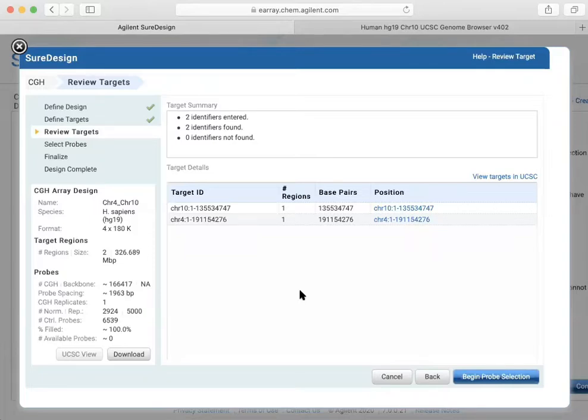I would say at 500 bases it's the easiest, and it just gets a little bit harder from there. But 500 bases is very dense and wouldn't necessarily be an array that you'd be able to use again for something else. Between 1,000 and 2,000 bases average spacing, I think, is the easiest to do.